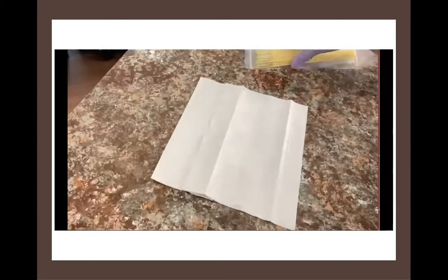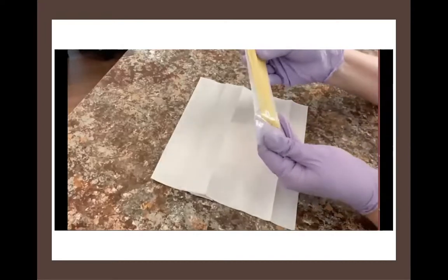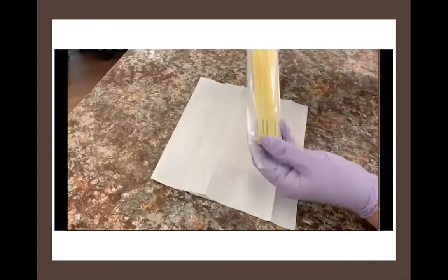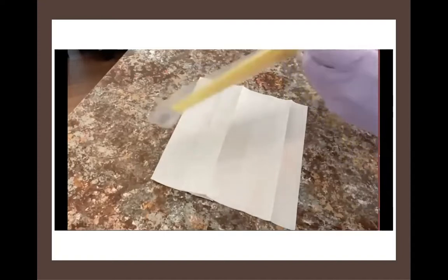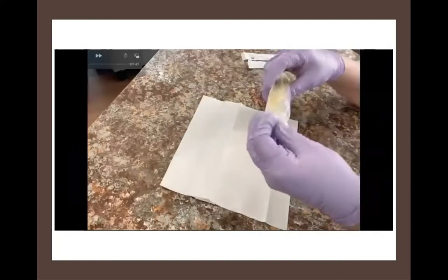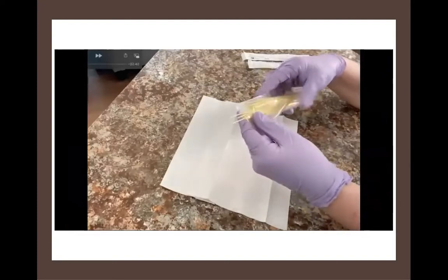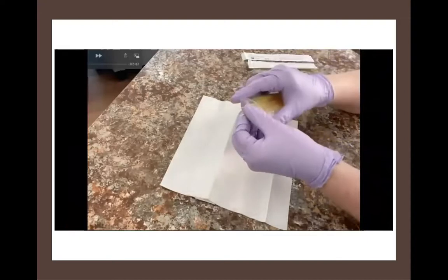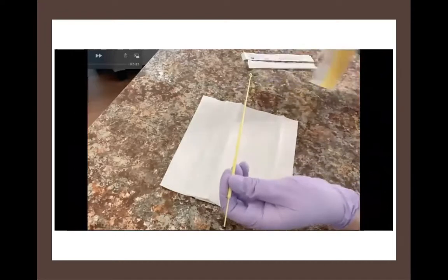The last thing I want to talk about today isn't directly related to aseptic technique, but it's the tools that we have available in addition to what we've talked about already. These are single-use, disposable inoculating loops. They come in a sterile package of about 50. When you open up these packages and you pull out the loop, you can see the handle end is what's going to come out first. So you widen up the mouth of the bag and you carefully pull this out and you've got a sterile loop at the end.